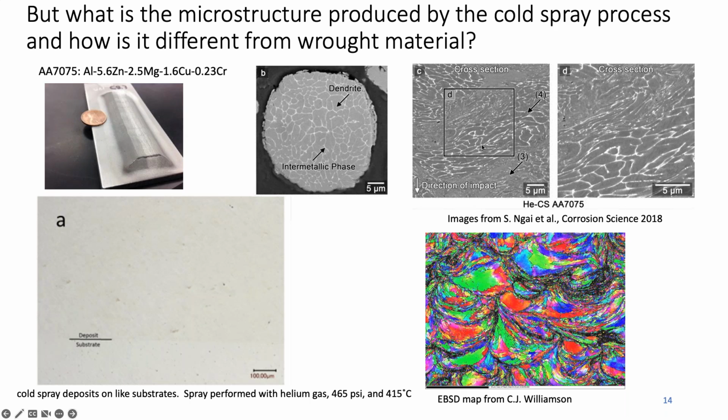We're going to call those prior particle centers. And then you also see that there's regions in between prior particles, and we're going to call those prior particle boundaries, and they have a very different structure.